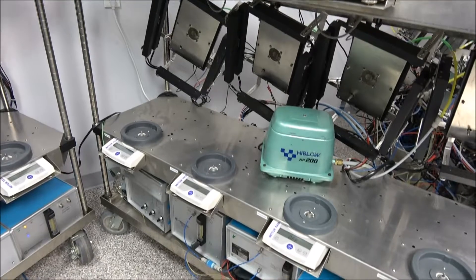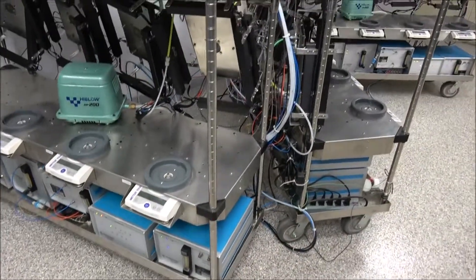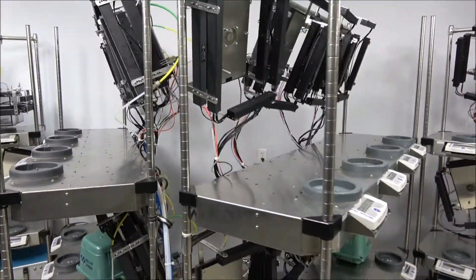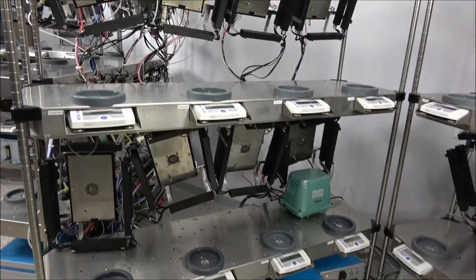New Life Scientific will offer a 30-day warranty on this system because we're confident that this is a working instrument that will meet your laboratory needs. If you have any questions or concerns regarding this instrument, please contact us or visit our web store.